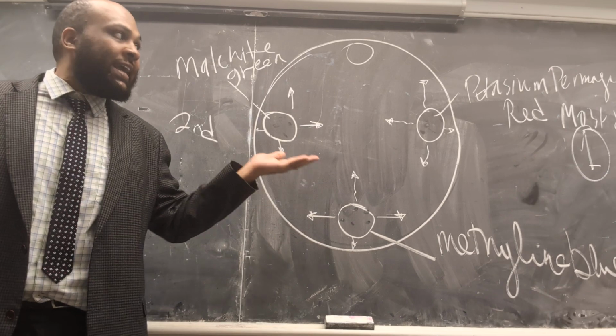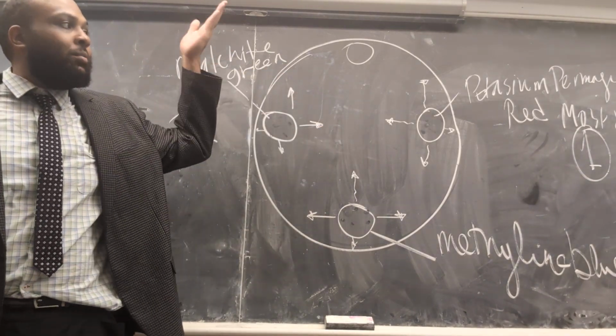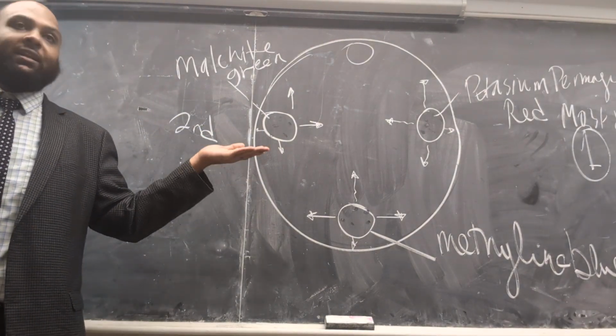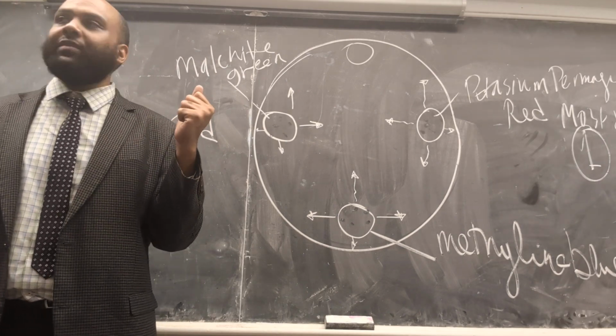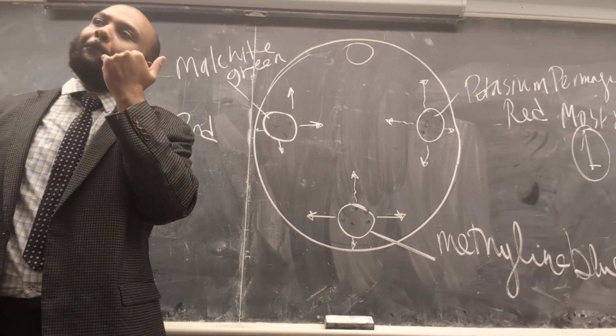I said the weight. I said red color, and that's the most dense. And this is the second dense. I did say it was dense. So what is that going to give us? Are they gonna layer on top of each other, or are they gonna take out more space?